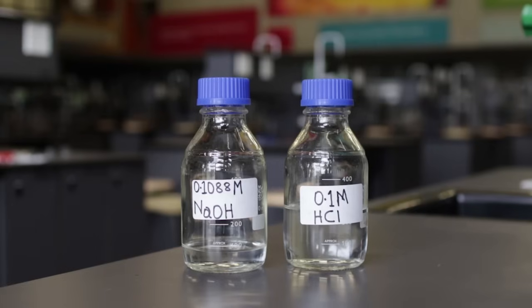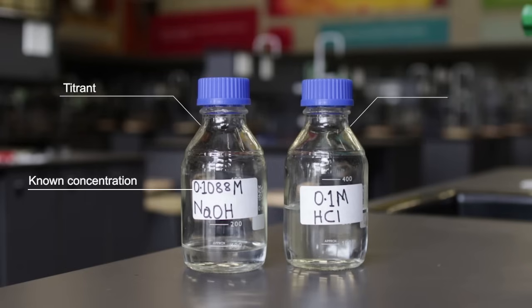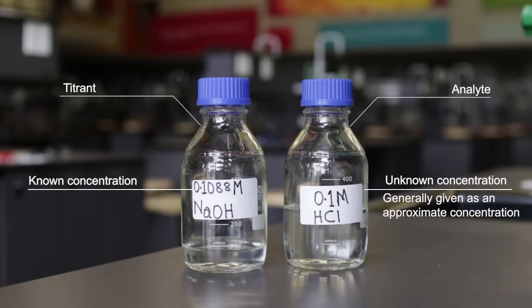What is a titration? A titration is a technique where a solution of known concentration is used to determine the unknown concentration of a solution.